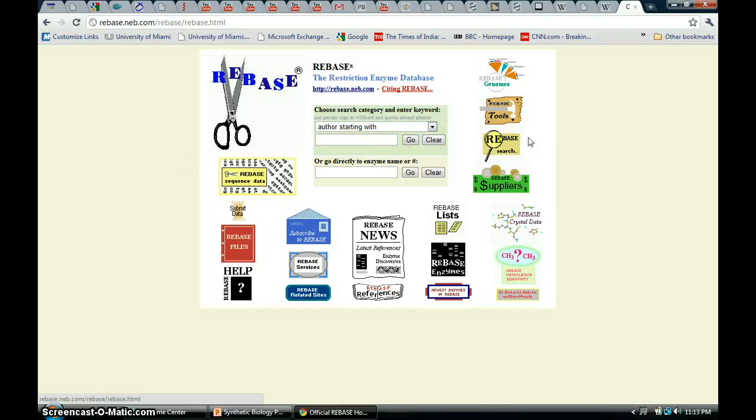If somebody works in a molecular biology lab, they need certain sequence data or restriction enzymes which would help them in transcription, or various other kinds of experiments. This site is very essential to find out what restriction digests can be generated.